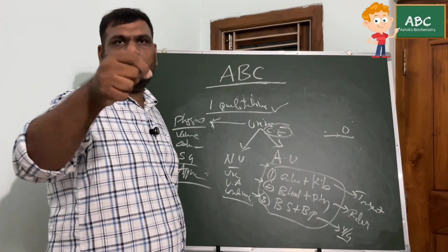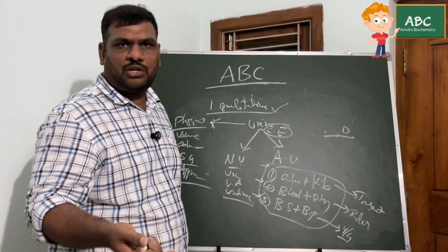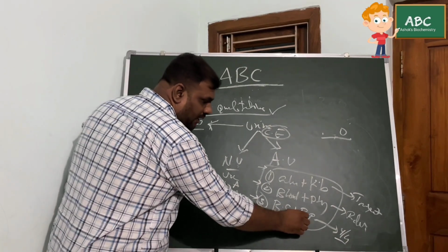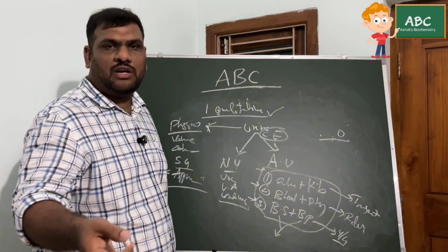When they ask, I say, sir, I did all the 6, but I got these 2 positive. You can save the time. You don't need to rush. You don't need to remember anything else. I'll tell you some tip in this. If you got a viva also, if I got bile salts and bile pigment, they'll ask those things only. Which one is called bile salt? Which one is called bile pigment?